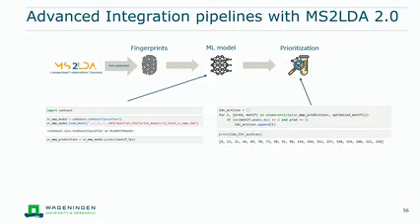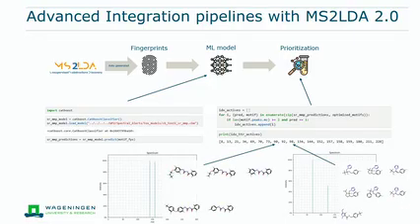And when I have a closer look, then you probably see something we're familiar with, Mass2Motif 90 and 98. And those are related to those 2 pesticide classes. And that's a quick way, with not a lot of programming experience needed, that you can build your own workflows. So I'm very happy to talk about that if you're interested in those workflows. I'm working on that myself, so feel free to ask me anytime.